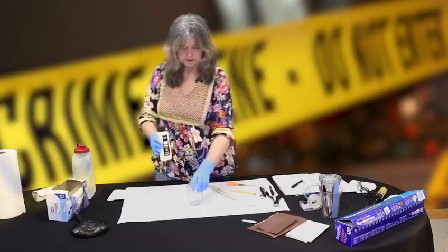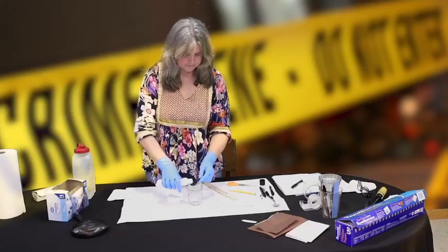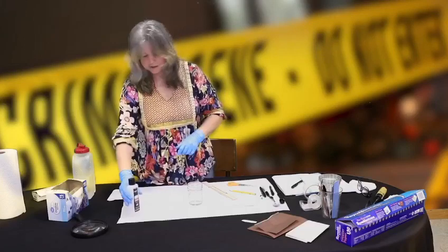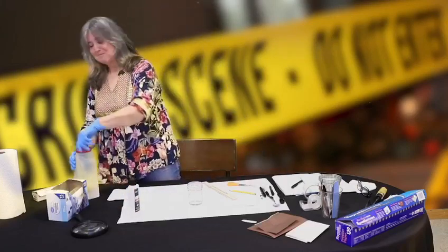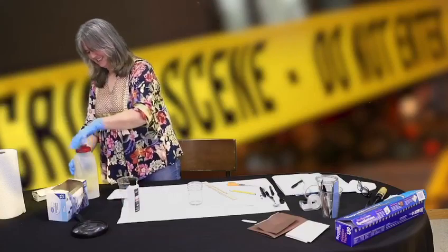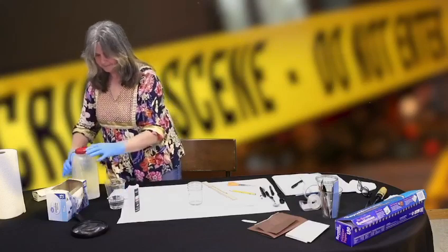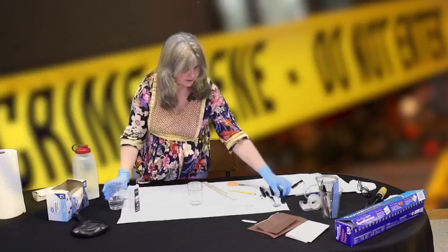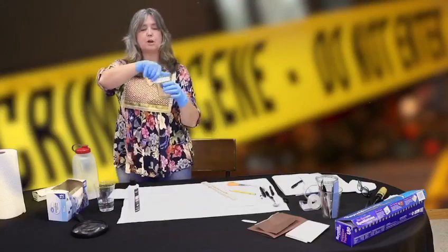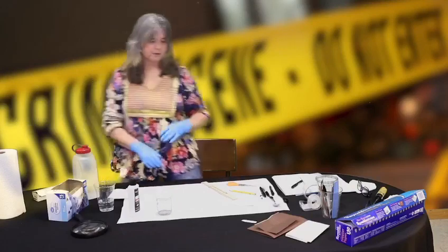Now we're going to prepare our solvent. We want to put in one teaspoon of acetone and one teaspoon of water. That's all you need — it's a very small amount. This is a case where less is more. We make the solvent first because we're going to let it sit and let our chamber fill up with the fumes from the solvent.